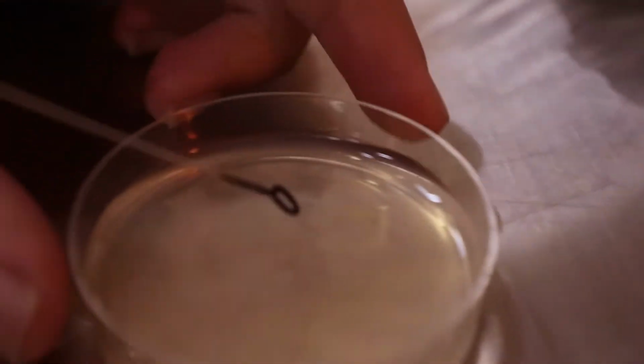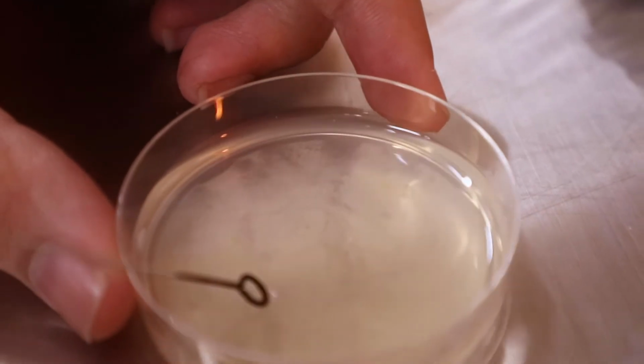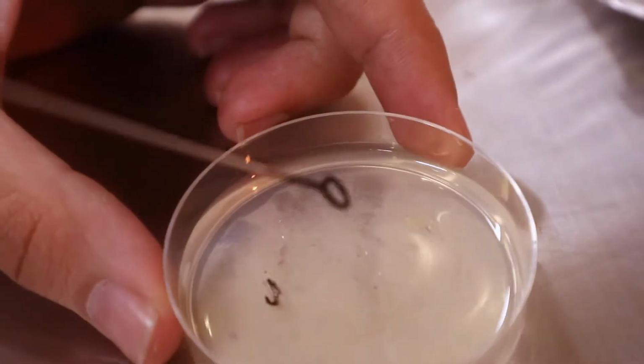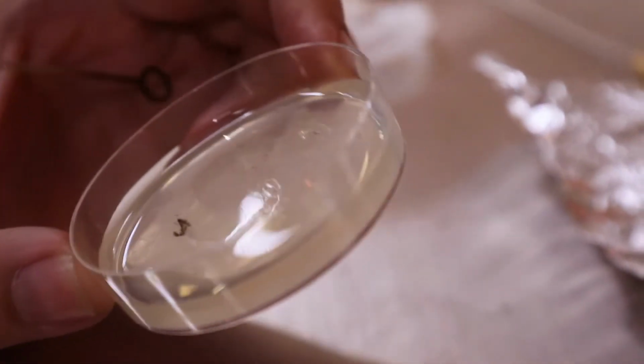See here, draw. Oh, this is a whack beat. Oh no, look at this. I don't know if this will contaminate the whole colony, but you can see the V shape. I can see the V shape. It looks whack, but it's the V shape. Okay, so we have finished. Some failure, but I think it will turn out great.